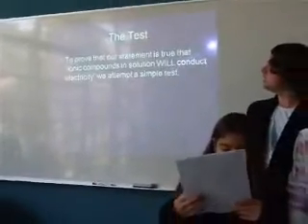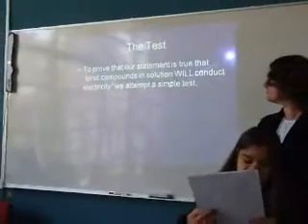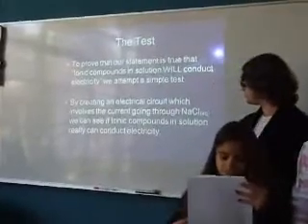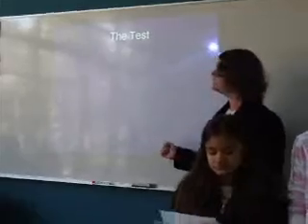The test. To prove that our statement is true, that ionic compounds in solution will conduct electricity, we attempt a simple test. By creating an electrical circuit which involves the current going through sodium chloride aqueous, we can see if the ionic compound in solution really can conduct electricity.